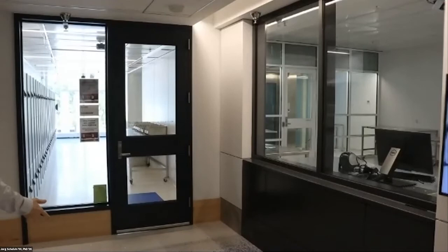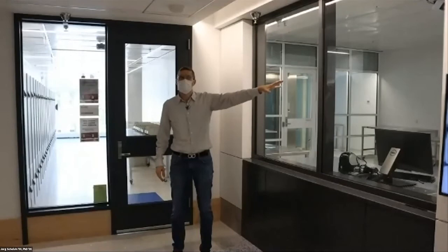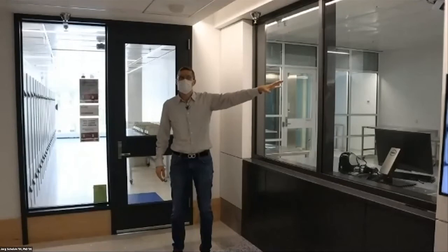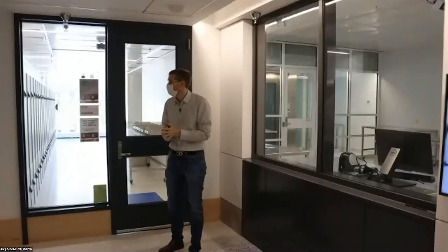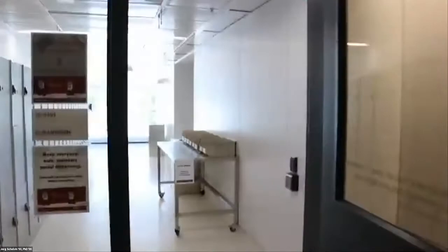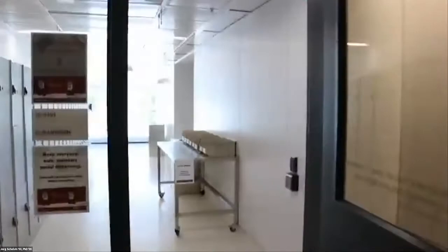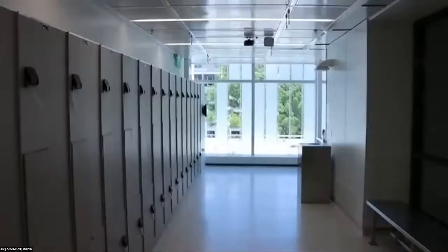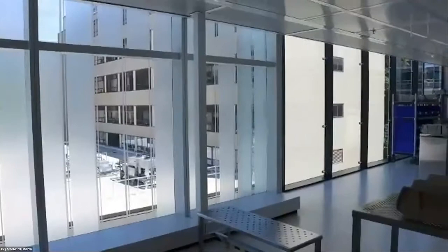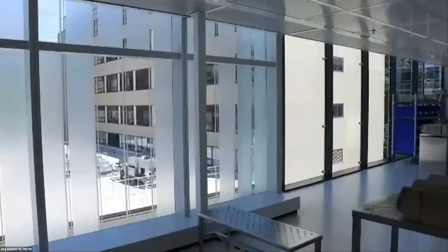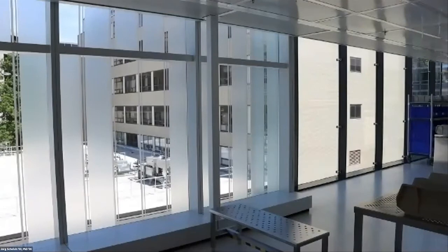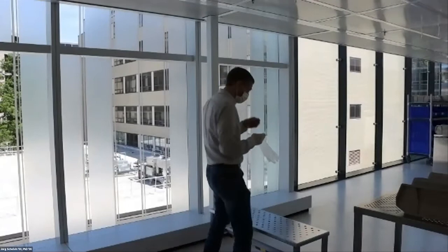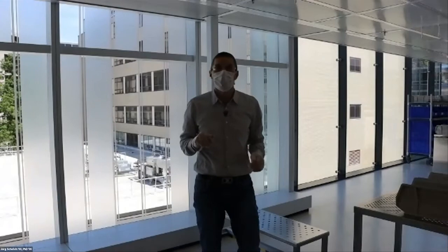So now I'm standing outside the main clean room. The clean room actually is on two floors. We're on the third floor here and we have an identical clean room on the first floor and they're connected by a clean elevator. But this is the main way in. Roll through before the door closes on us. The door is automatic because it helps us stay clean and hands-free. A lot of lockers here because people ultimately come from many different areas of the campus and especially in winter when you have lots of gear, this is helpful.